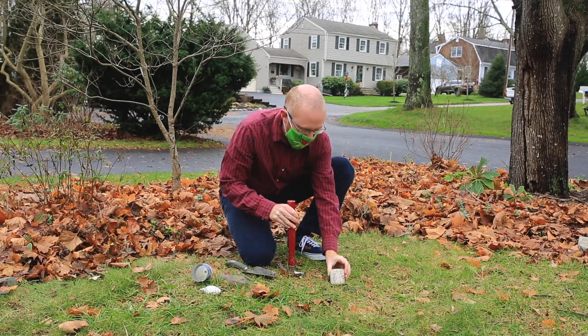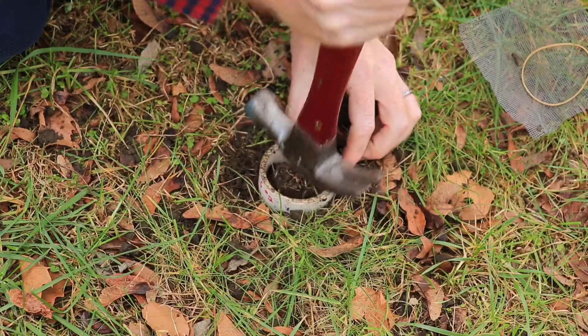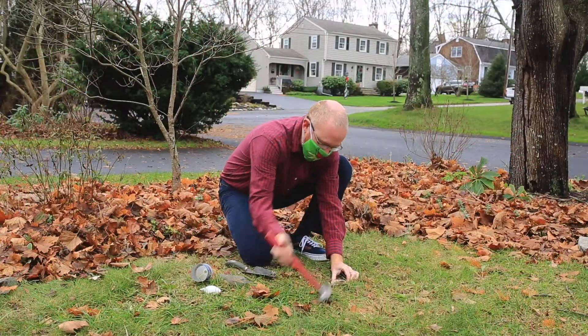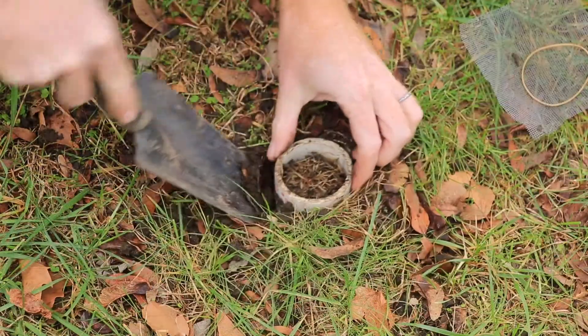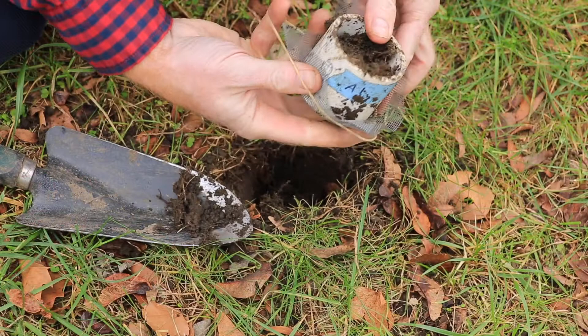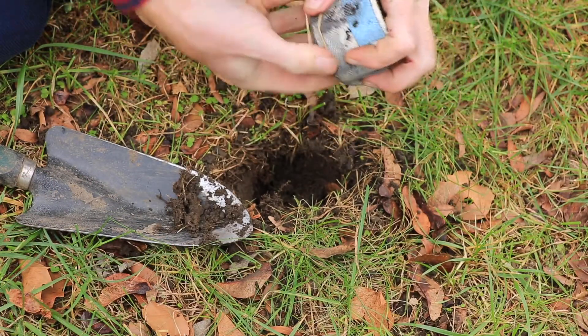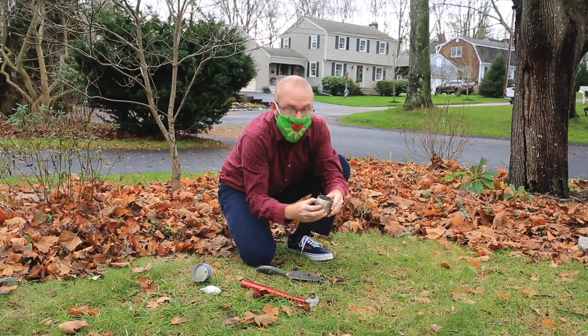We have a soil core, and gently tap it into the ground to collect a volume of soil, extract it, and then with a little bit of mesh screen to help hold it in place, rubber banded on securely.